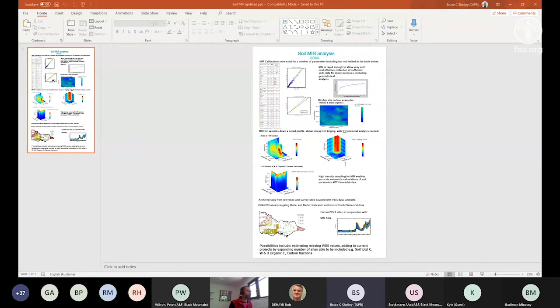You can see that there are slight improvements, more particularly in the error. Same thing here. So there shouldn't be an assumption that machine learning type processes are necessarily any better than PLS, and they're a lot more complicated. So I just point that out there. The rest of it's all pretty standard.